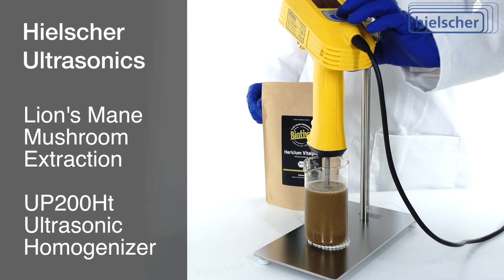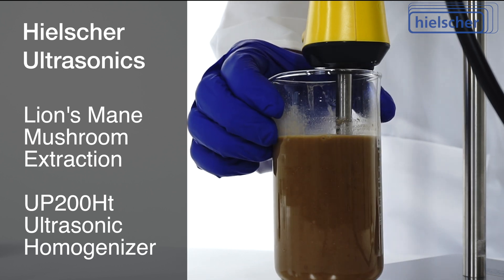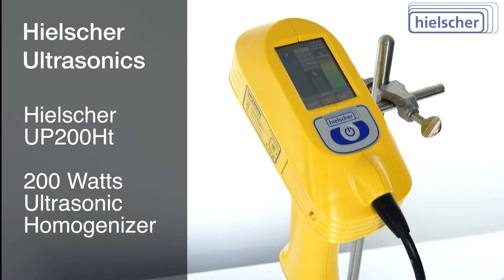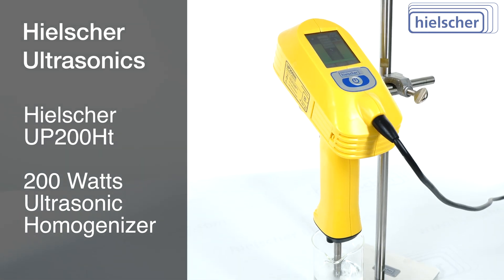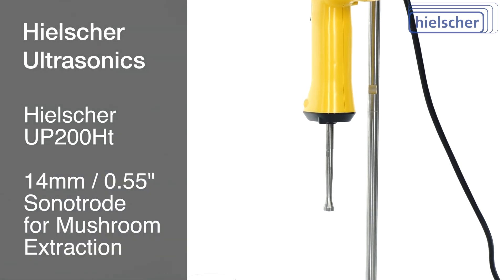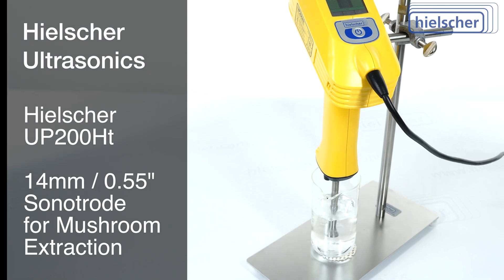This video will show you the highly efficient extraction of lion's mane mushrooms using the Hielscher UP200HT ultrasonic homogenizer. The UP200HT is a powerful 200-watt probe-type ultrasonicator. The 14mm probe used in this video is well suited for mushroom extraction in smaller batches.